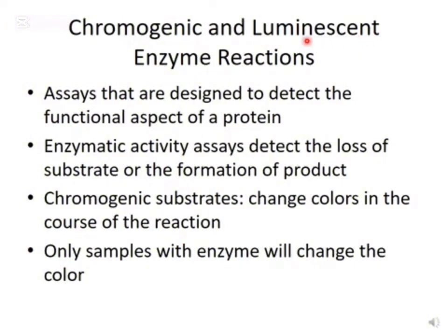Luminescent reactions are those that result in the emission of energy in the form of light. And here we can measure how many light units there are, and of course the more light units there are, the more energy was emitted, so the more efficient the reaction is. Another form of reaction that we are going to discuss later is the ones that result in fluorescent signals, but this will be discussed in a couple of slides.